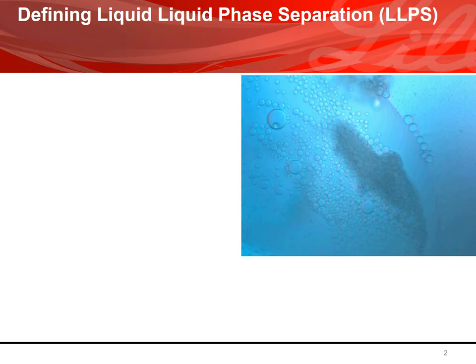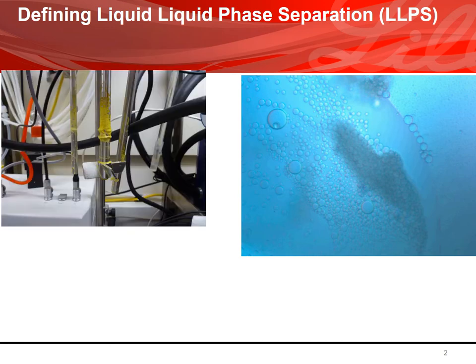Liquid-liquid phase separation, or demixing phase, is commonly known as oiling out. In the pharmaceutical industry, it's often encountered by chemists when they develop a synthetic route for an API. It describes the presence of oil droplets in a continuous phase. From a process perspective, it is an undesired phenomenon as it leads to the formation of an impure sticky amorphous solid — the opposite of a controlled crystallization process — and on scale-up it can also damage equipment.